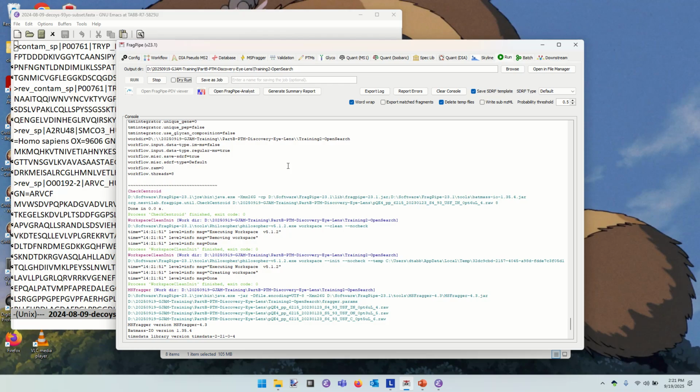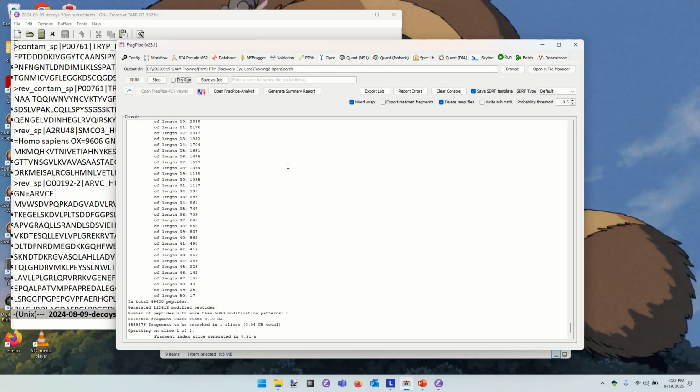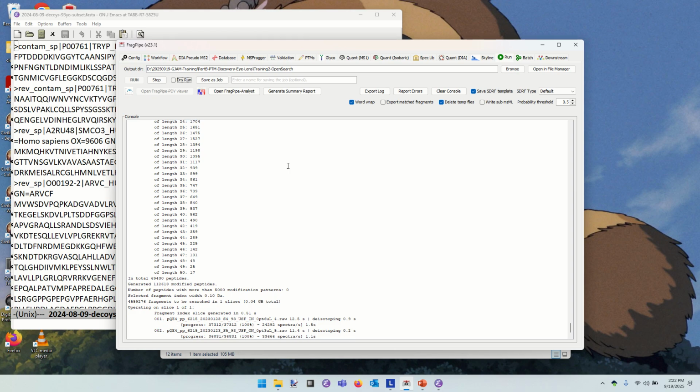So let's talk about search space for a minute. I think it's a fundamental concept, but it bears talking about. The search space is the set of peptides and decorations that must be considered in explaining a given MSMS. We often talk about the sequence database as the search space, and it's a start. If I have one sequence in my database or 100,000 sequences, that's obviously got a big difference in how many comparisons I must make to a given spectrum.